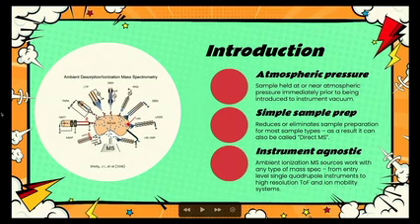And ambient ionization sources tend to be instrument agnostic. There's no one source that's highly specific to a vendor. It's possible to do most types of ambient ionization with most vendor instruments. Though there are, as we will come across shortly, some patent and some sales restrictions that tend to lock certain techniques a little bit more closely with some vendors. But there's nothing in terms of the actual design of the instrument that tends to restrict ambient to one vendor.